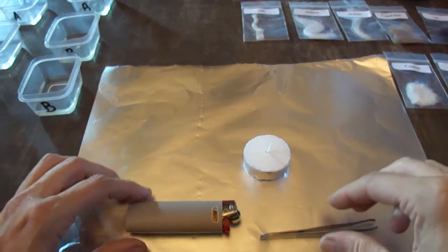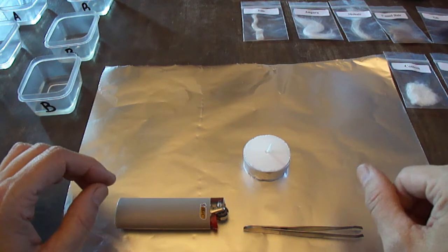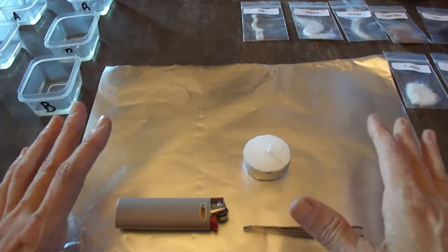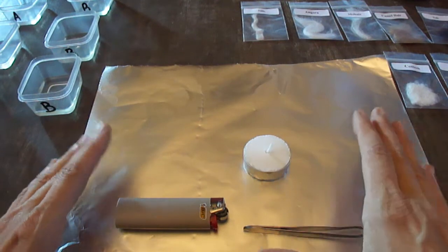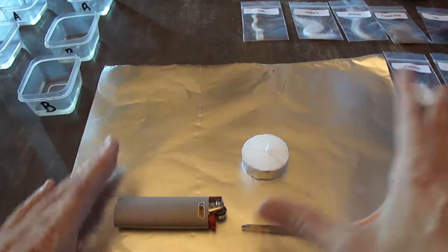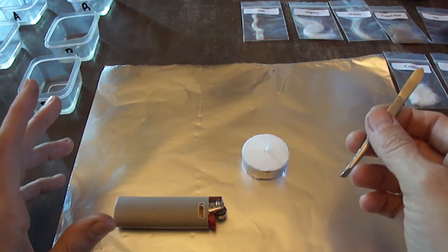This is how I would set up doing the experiments for fiber identification by burning and by solubility. I've got tons of fibers all set out and labeled clearly. I've got a little piece of aluminum foil down as a place to work so I don't get the table burned or dirty, and a little tea light candle — any candle will work.